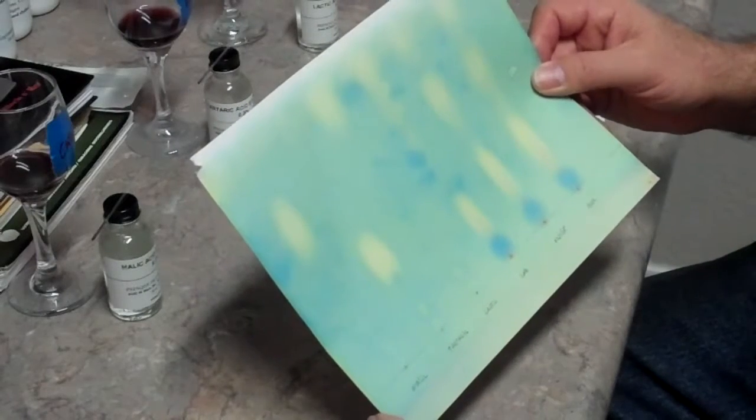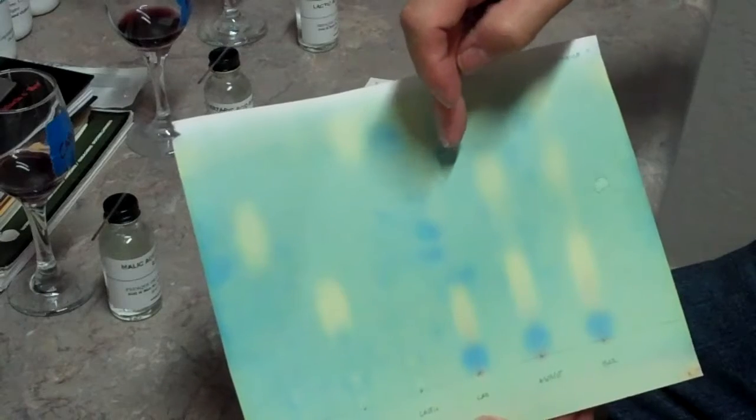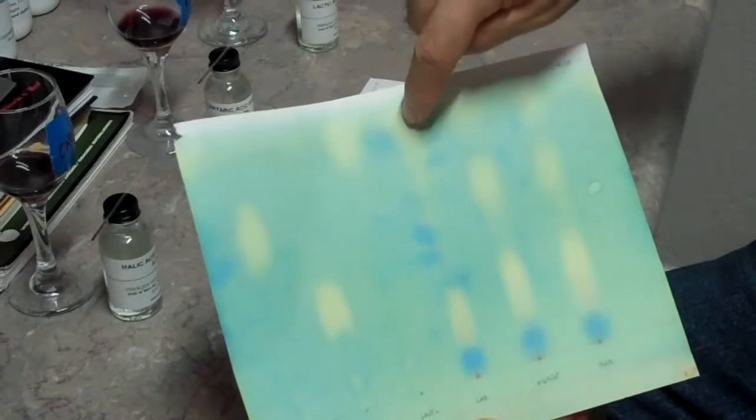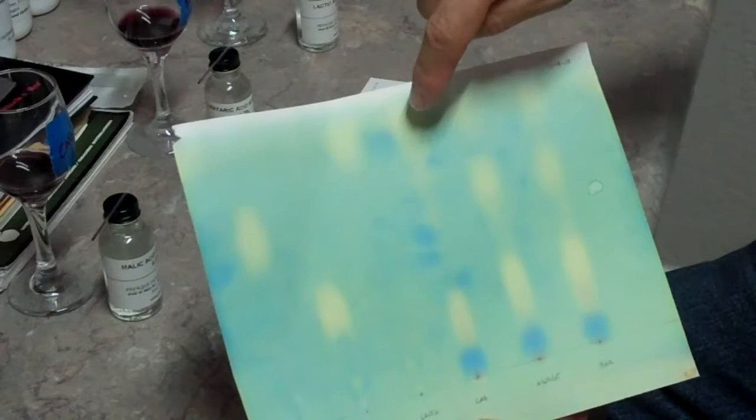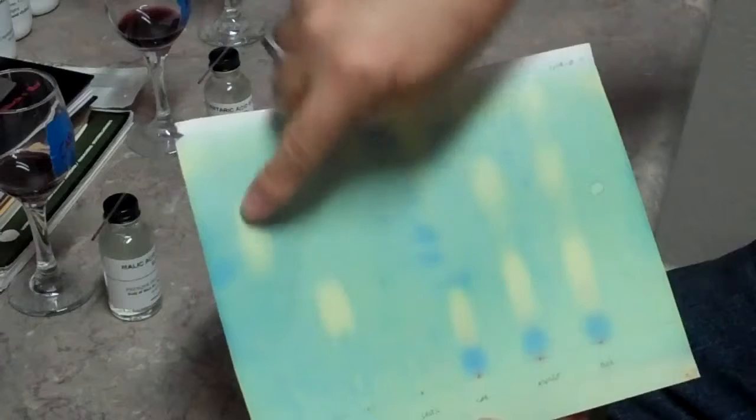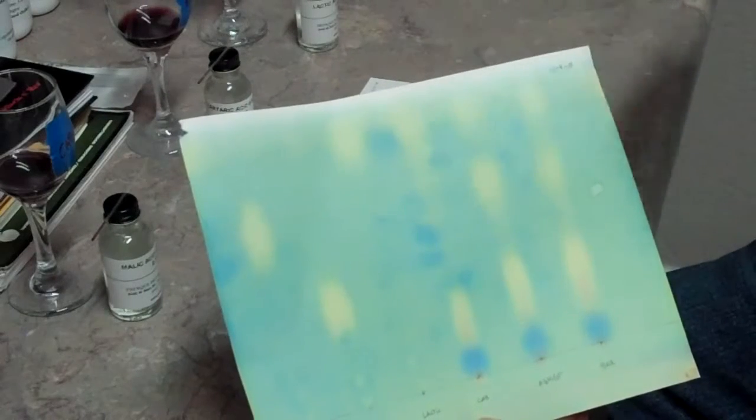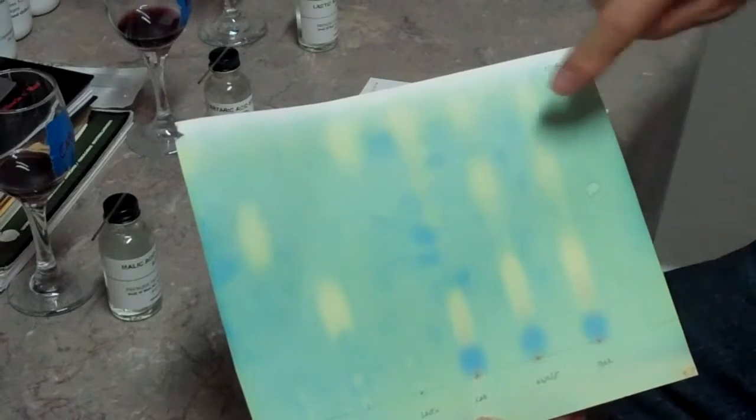I'm testing these same three wines. I can see that my cab has some lactic acid in it, which is good because we're turning the malic into lactic. My malic sample is here, and I have just a little bit of malic still left in that cab. That was on November 9th.